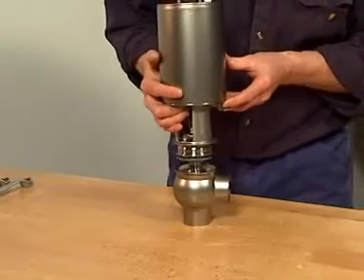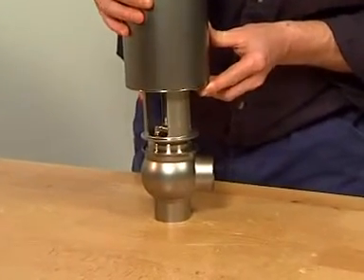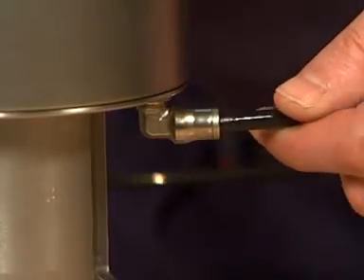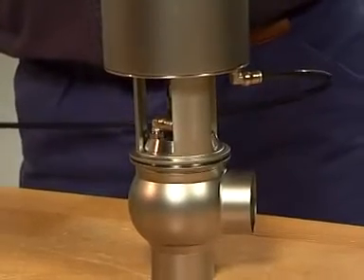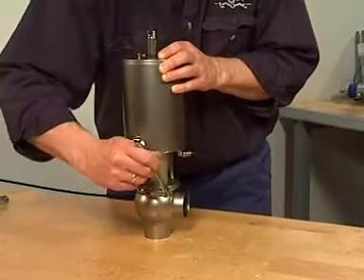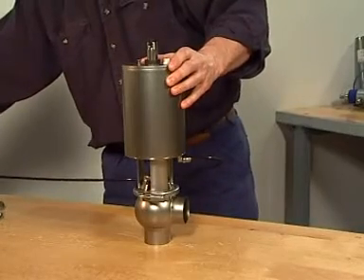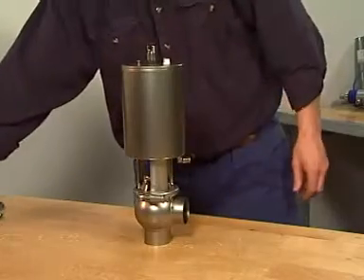Place the valve body and supply compressed air. Place and tighten the clamp. Release compressed air to the actuator. Activate the valve a couple of times to ensure correct functionality.